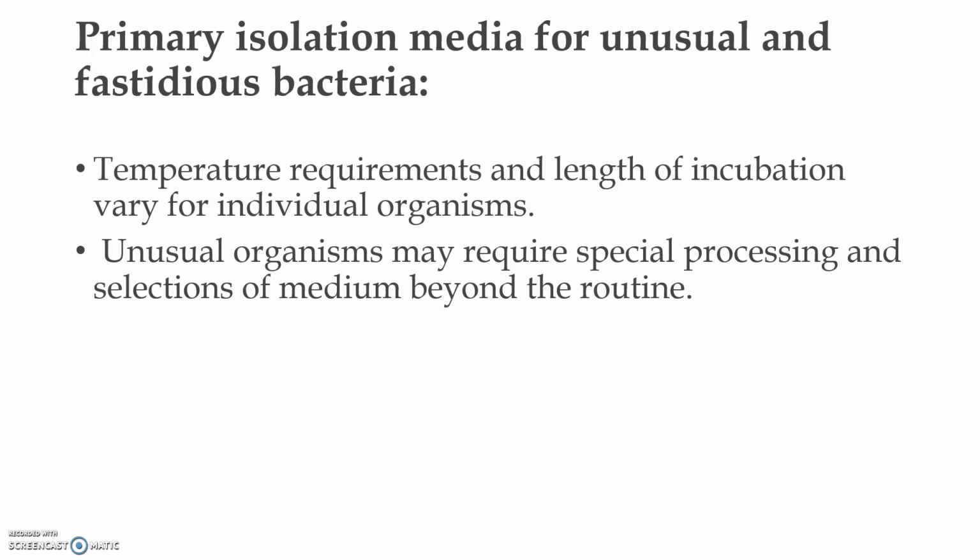We have told that fastidious organisms require 24 hours growth, and certain microorganisms, for example Mycobacterium tuberculosis causing tuberculosis, require a minimum of 7 days for growth. Then unusual organisms may require special processing and selection of media beyond the routine. An example of such organisms is Mycobacterium tuberculosis.